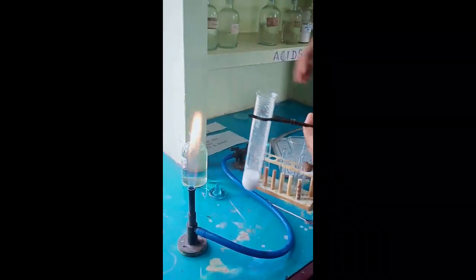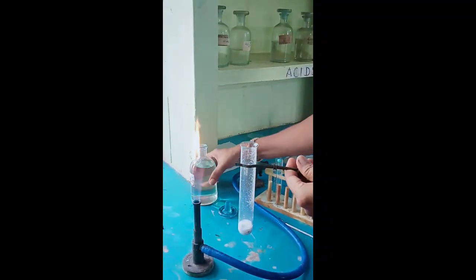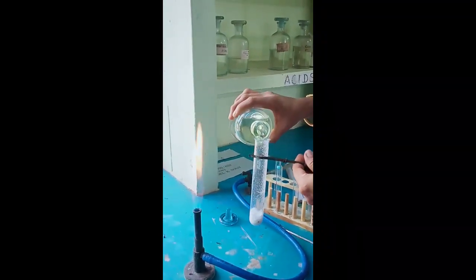First one is carbon dioxide. Carbon dioxide is a colorless acidic gas, and the test for carbon dioxide: on passing carbon dioxide through lime water, it turns milky. So now we are going to observe the reaction. What do you observe on adding dilute acid? A brisk effervescence and a colorless gas is evolved. The colorless gas turns lime water milky.